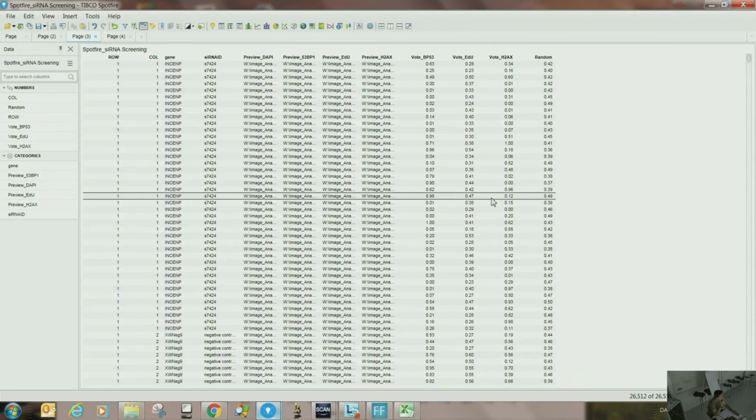Yes. Exactly. Of course, for showing cells, Spotfire will ask you, because it cannot show you all the cells for that particular gene. That's not possible. It's only one image. That's a limitation of Spotfire. So you have to give what criteria you want to see. Let's say I have 100 cells for one siRNA. Is it the first or most common or something like that? That's why I used first, because that should be enough as a representative for an siRNA. Well, you have to see the variability in the cells also. But yeah, okay.